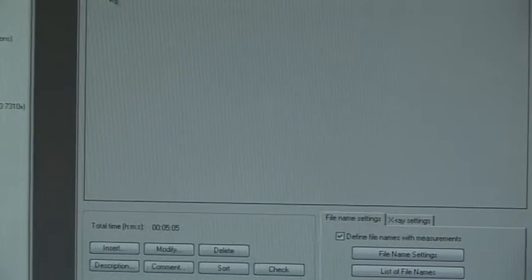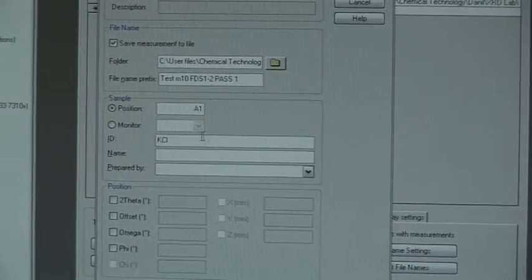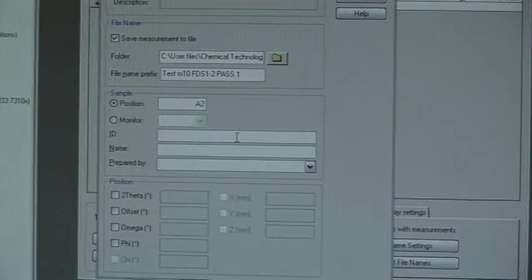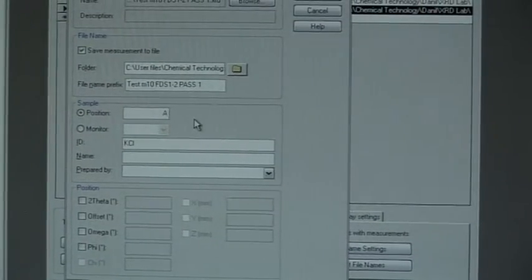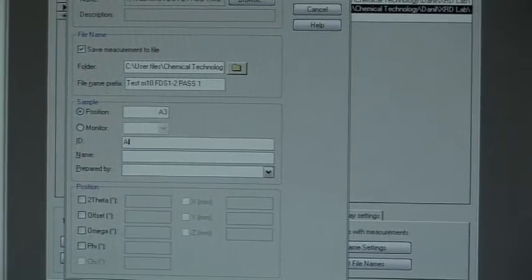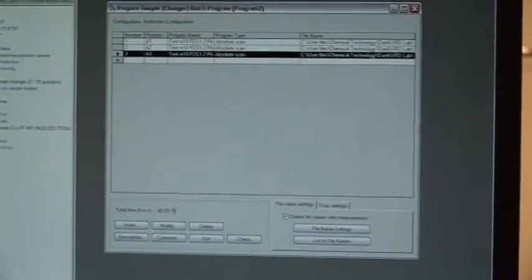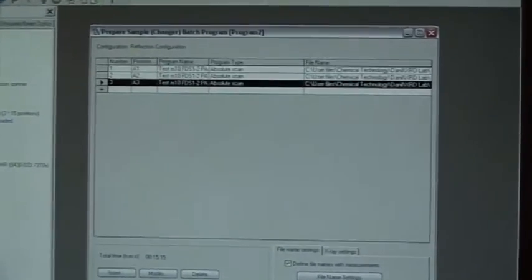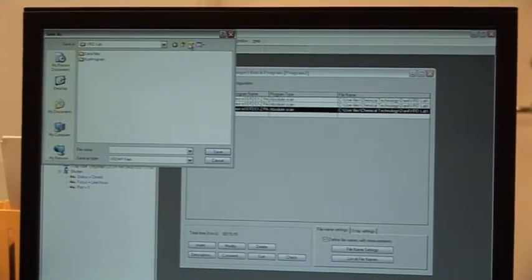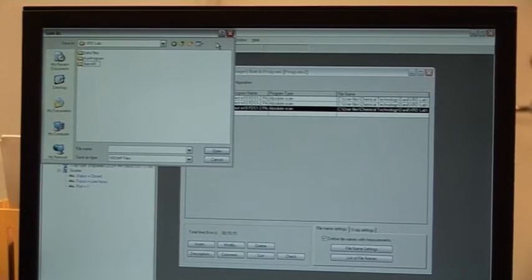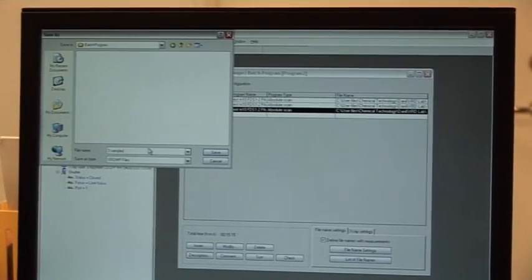The easiest is to copy this line when we want to use exactly the same program. Then we don't have to change this part, we can just change position A2 and it's zeolite X. Then we go here and change it to position A3 and that is alumina disk. Then you see the total time becomes now about 15 minutes. We save it also.